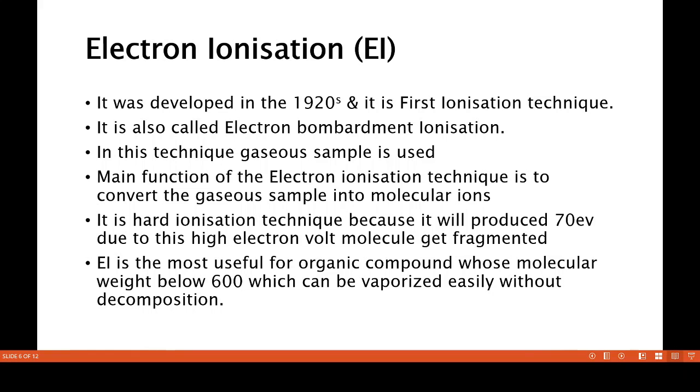Why is this technique called hard ionization? Because it uses high energetic electrons to produce not only the molecular ion but also fragment ions. This leads to extensive fragmentation, which can be helpful for the structure determination of an unknown compound.